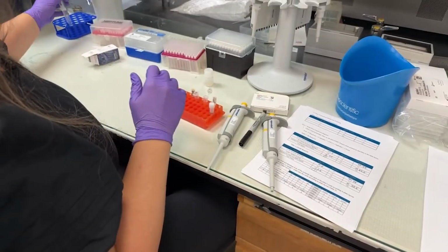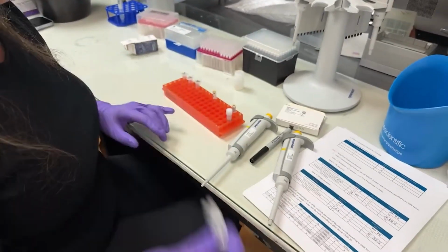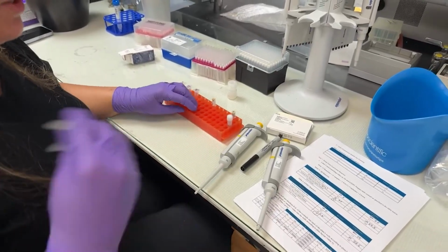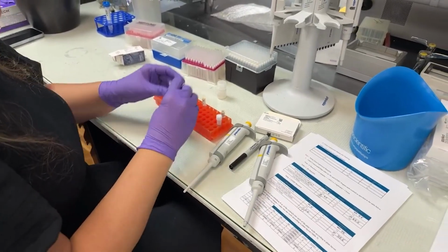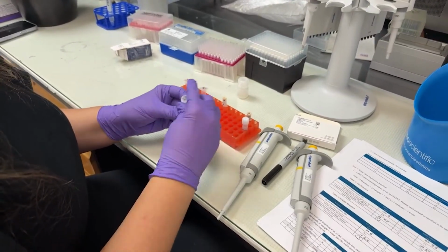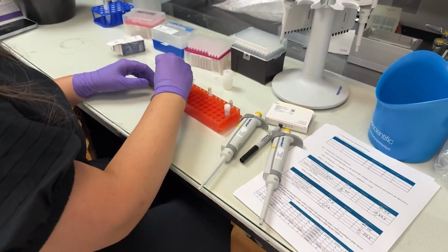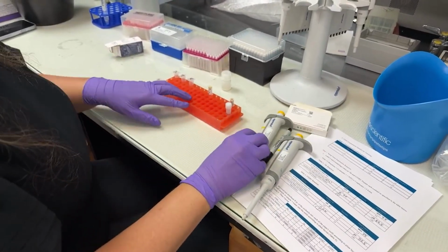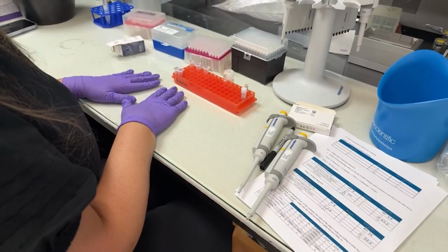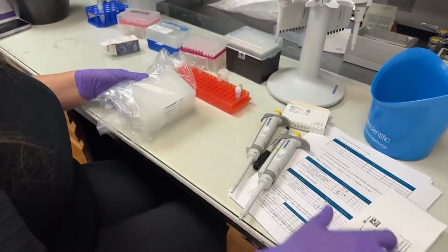Excellent. Okay, so now we are well on our way to getting this reaction completed. For each of these, we have done 3 pipetting steps. It's not a lot, really. There's a lot more difficult processes in the lab for sure. All right, I'm going to put that to the side and talk about our plate and plate seal.